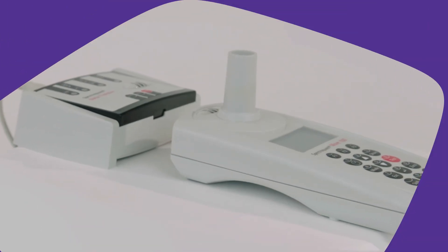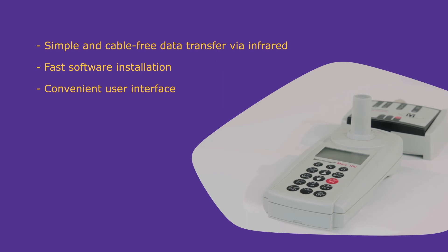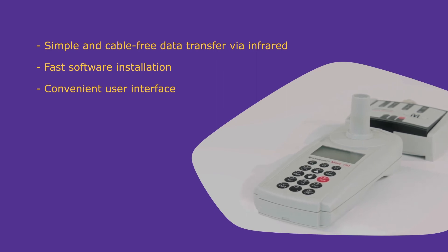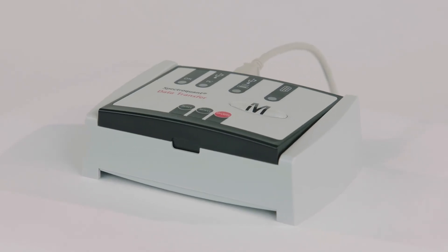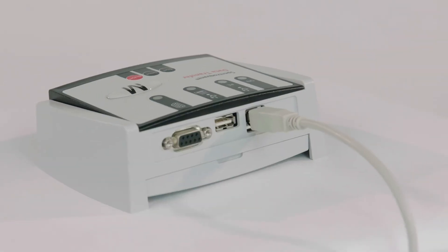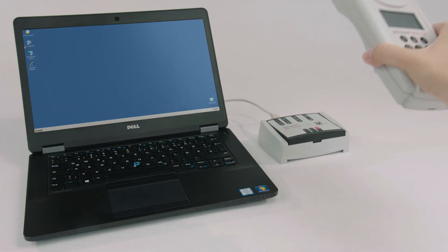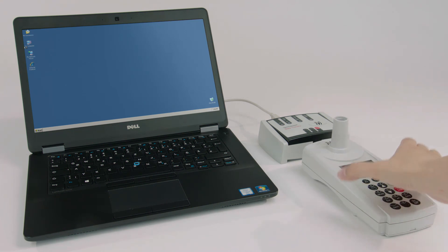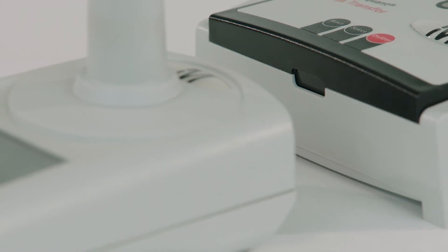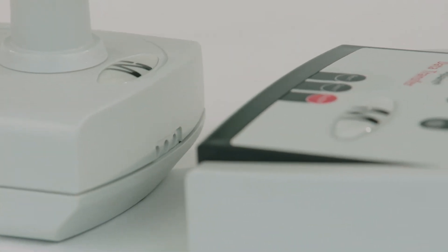No paper or pen at hand? No need to waste time on data management, leaving you time to concentrate on the results. Transmit your data simply and easily to a printer or PC using the Spectroquant Data Transfer Infrared module and software. Once the software is installed, data transfer to your PC or printer is fast and easy. Connect the infrared module to a PC, printer, or to a serial printer. The connection from the MOVE 100 to the module is via infrared, meaning that no cables are required.